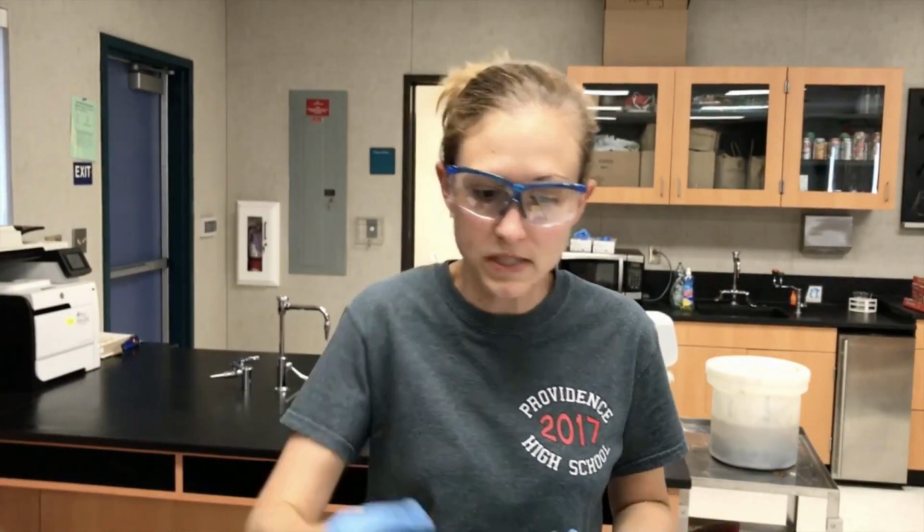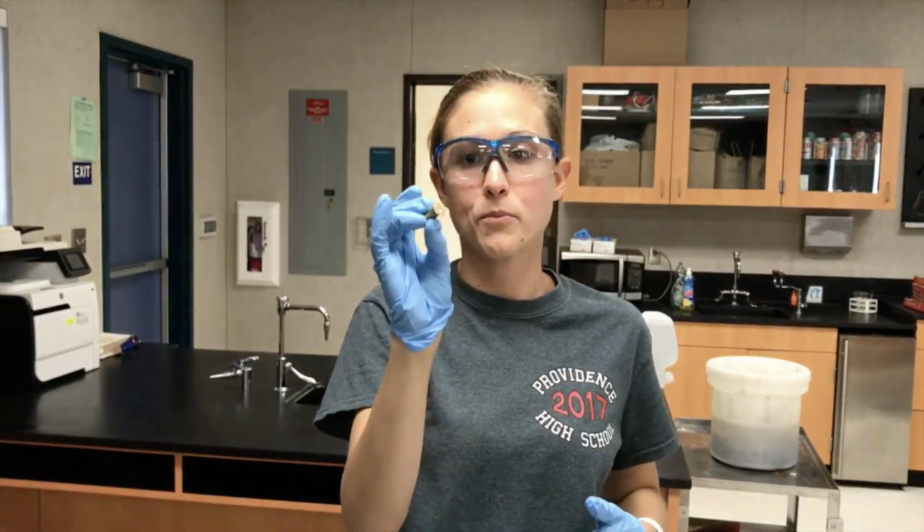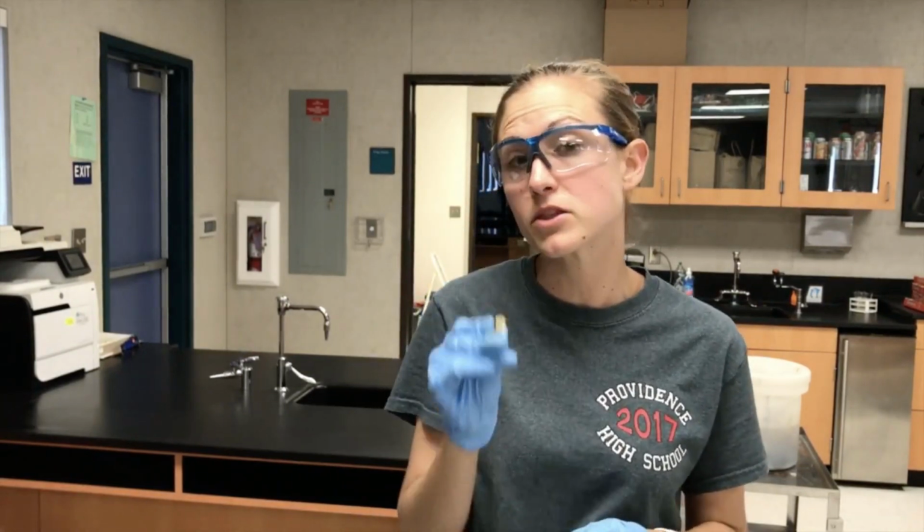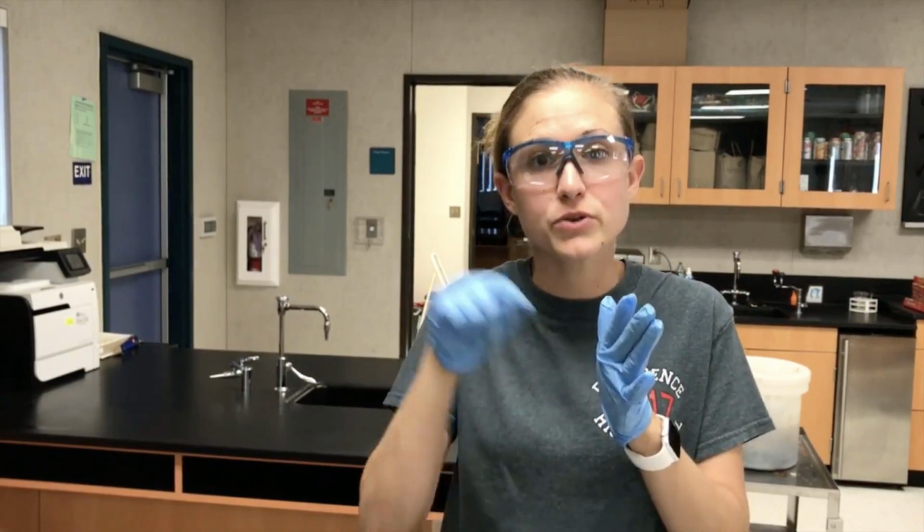So in this lab, we're going to be making a copper solution using our brass shell casing. And that's going to be blue in color, and using our spectrophotometer, which I'll show you in a second, we'll be able to determine the concentration of copper in the solution by finding absorbance. But in order to do that, we need to create a Beer's law curve. And so that's going to compare concentration and absorbance, and we will actually create that curve.